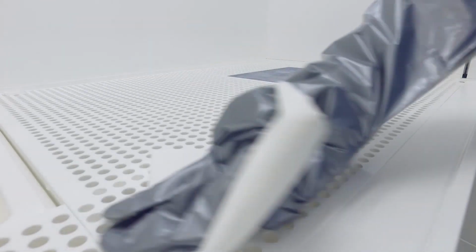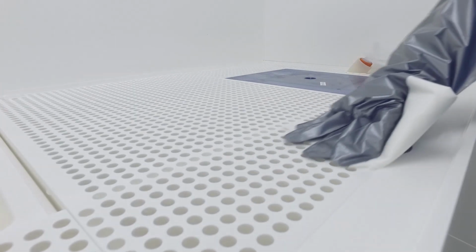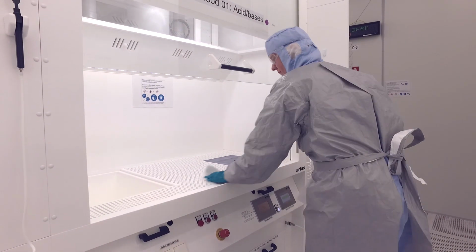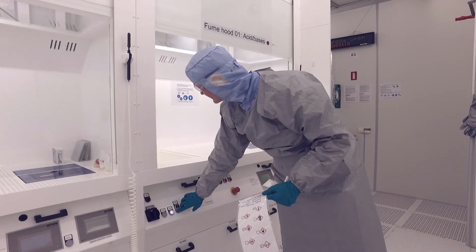Never leave behind any drops of liquid, not even water, because other people can't be certain whether it's water or hydrofluoric acid. If they get something wet on themselves, they'll have to assume that the spill contains hydrofluoric acid.